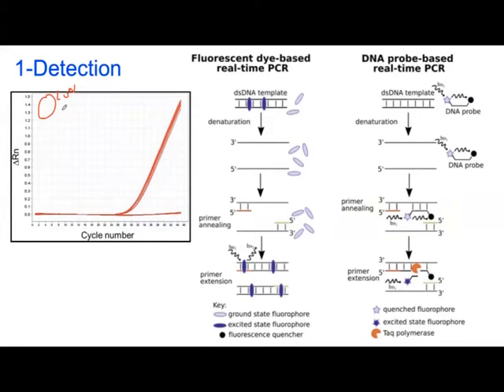So you need to run an RT-PCR method. You want to answer yes or no. Is this a cow or is it a gazelle? That's one of the questions. Another one is, you have a patient who may have a mutation. You want to answer, does this patient have the mutation, yes or no? That's the answer I want. I'm not interested in the quantity. I just want to say yes or no, absence or presence.